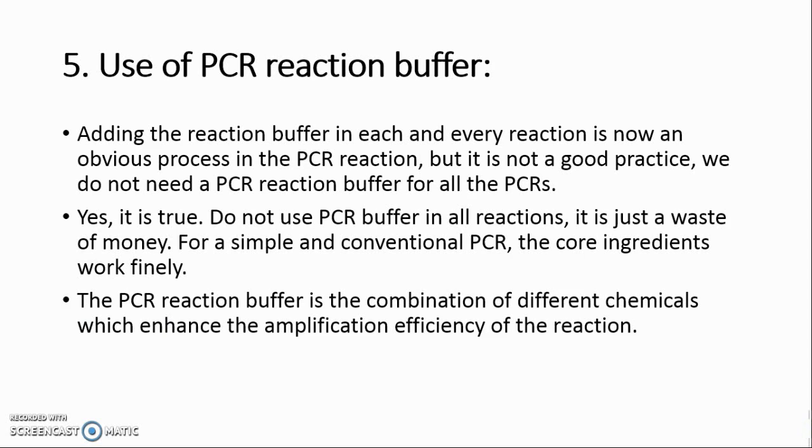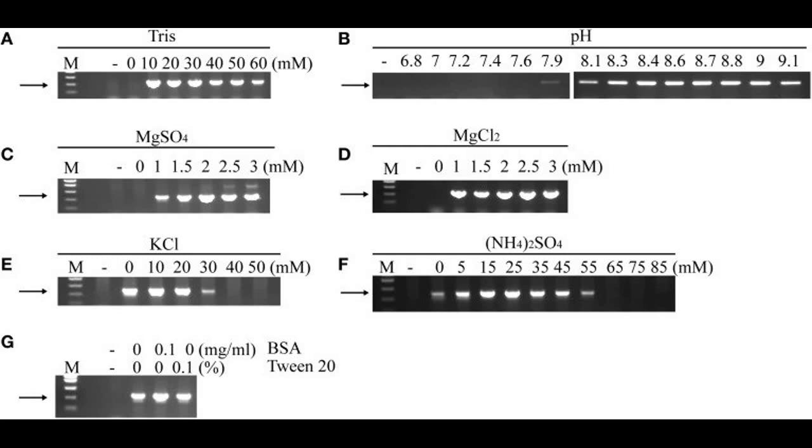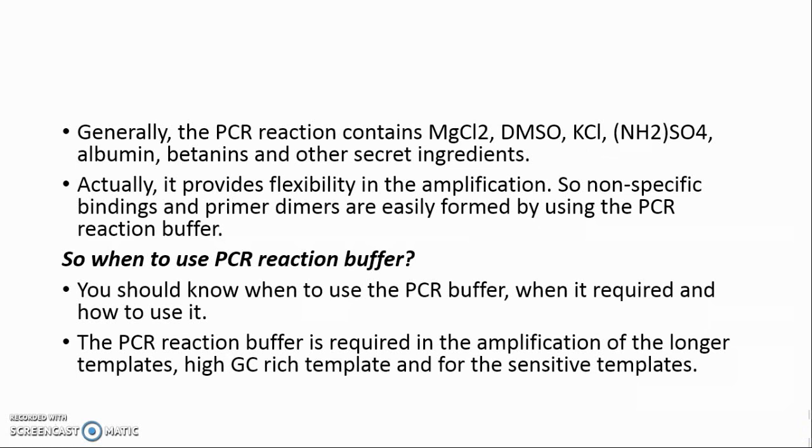Secret 6: Use of PCR Reaction Buffer. Adding the reaction buffer to every PCR reaction is a common practice, but it is not always good — we do not need a PCR reaction buffer for all PCRs. For a simple, conventional PCR, the core ingredients work fine. The PCR reaction buffer is a combination of different chemicals that enhance amplification efficiency, generally containing MgCl2, DMSO, KCl, NH4SO4, albumin, betaine, and other secret ingredients. However, it provides flexibility in amplification, which can also make nonspecific bindings and primer dimers more likely.